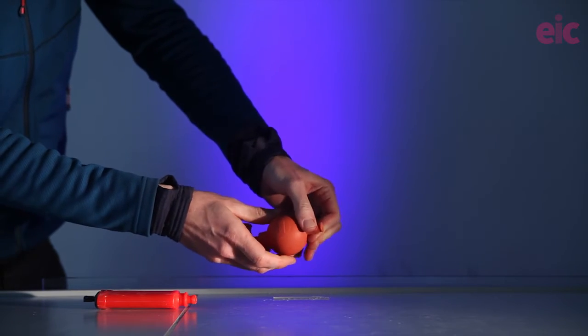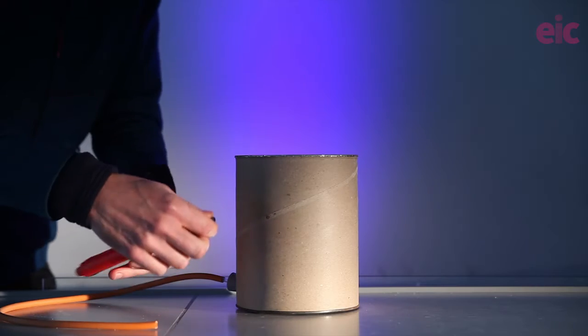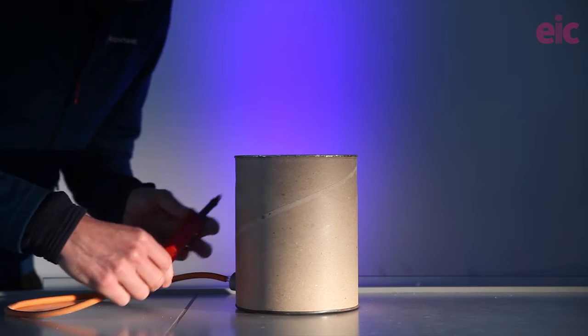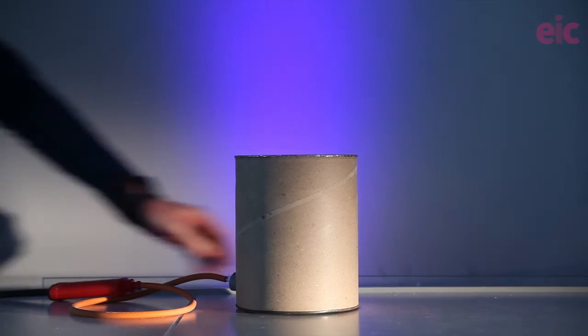Cleaps recommend the use of a pipette bulb for puffing the powder. One thing I've also always had to hand in any school with a post-16 chemistry course is a balloon pump. That often comes with the modelling balloons that you might use for teaching VSEPR. And if you're in a school that is using pipette bulbs — i.e. doing titrations — you probably also have some modelling balloons and therefore may have one of these pumps around as well.